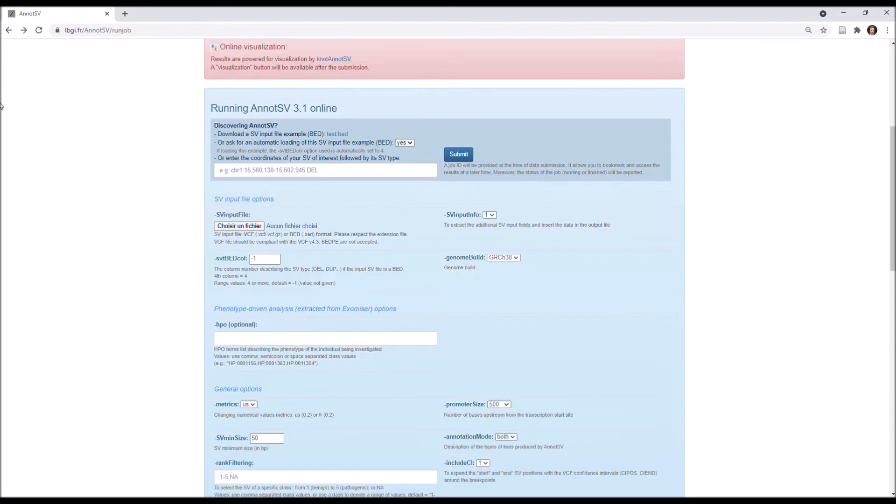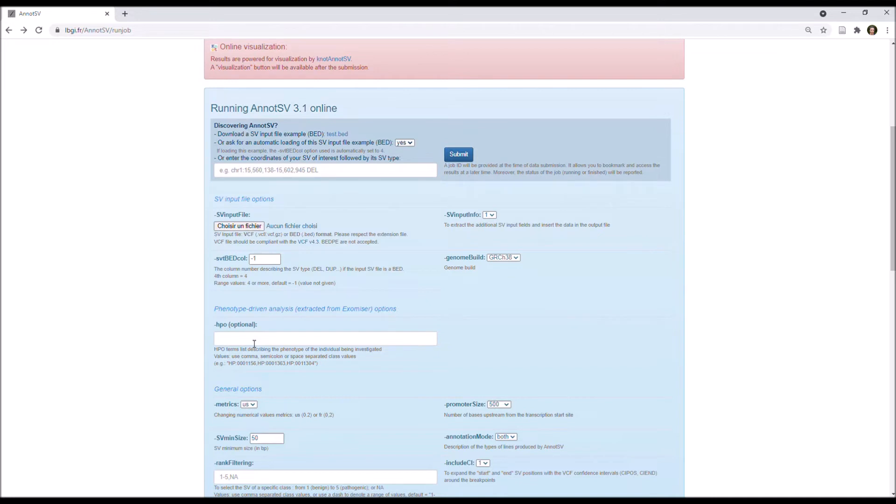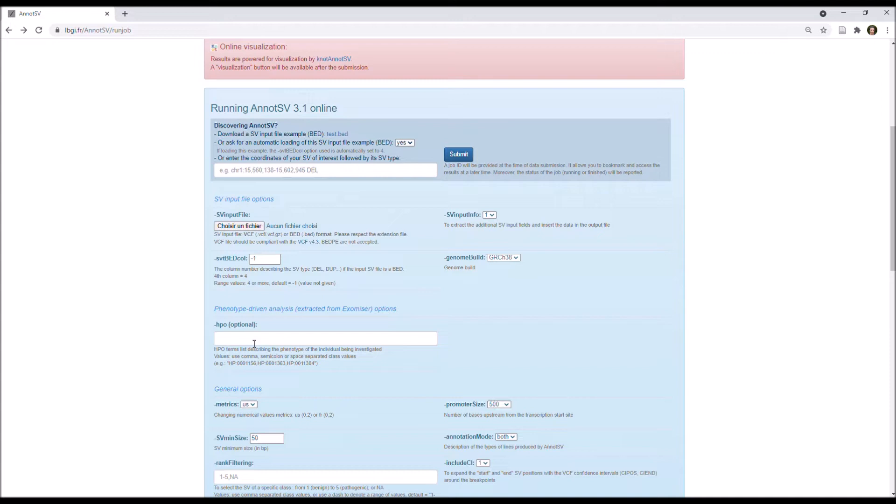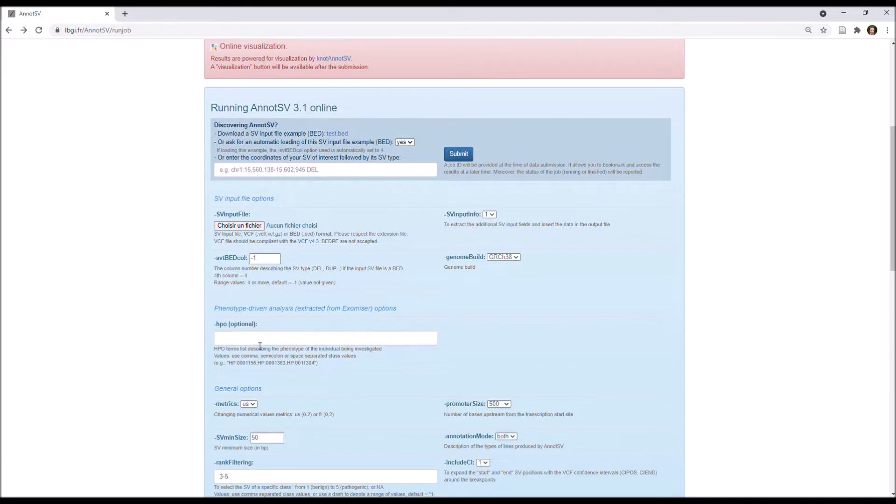And optionally, but it's highly recommended to use it, you can fill the phenotype field with HPO terms, so you will have access to a better prioritization. This means that the user can identify relevant SV, based on how similar the phenotype of the patient is to the gene overlapped with this SV.